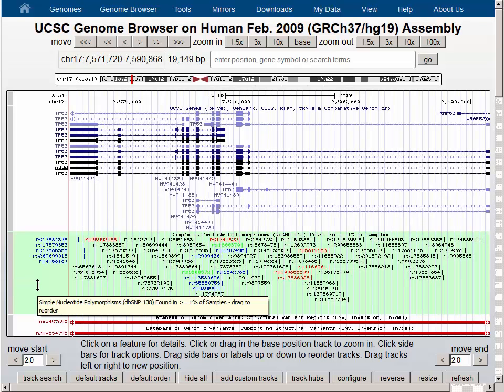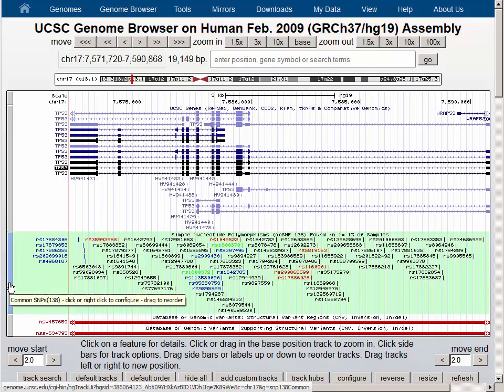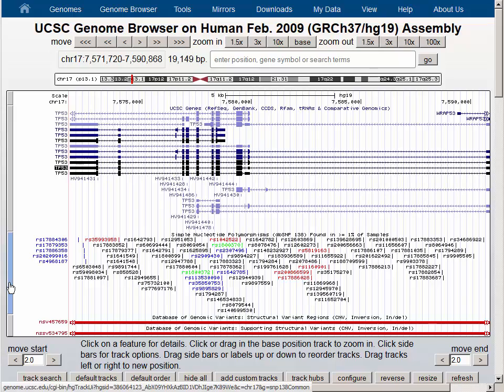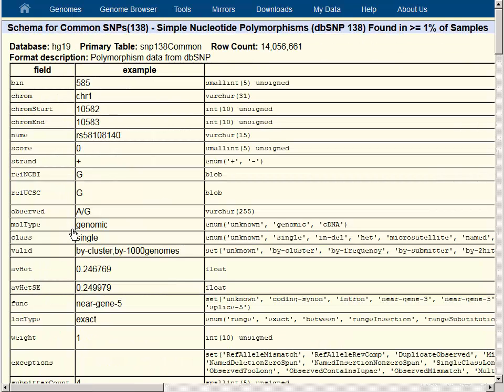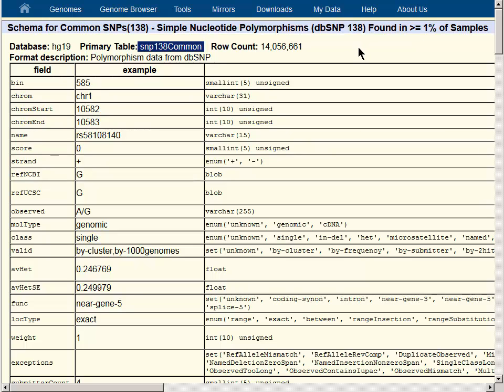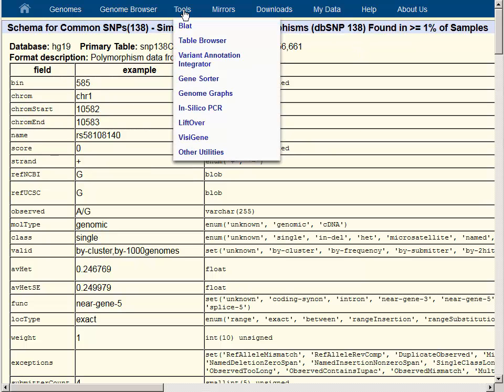Another way to tell the name of the table is to click on the little button on the left side of the screen. When a track is turned on, this little button takes you to a configuration page, which in the case of the SNP track, takes us to a page with a large number of filtering options and a number of other choices. On this page, the View Table Schema link will take you to a page that shows you the name of the database and the primary table that contains the coordinates for each of the items in the data track, if we wanted to download the table or query it using the table browser.